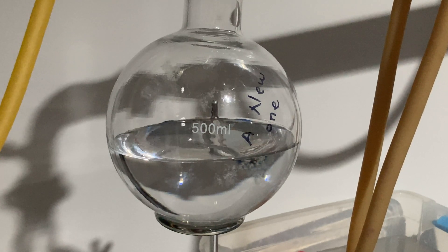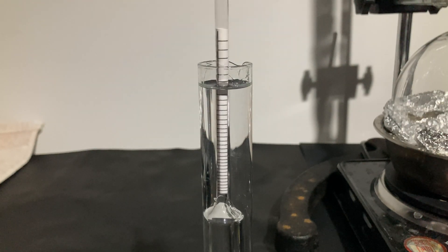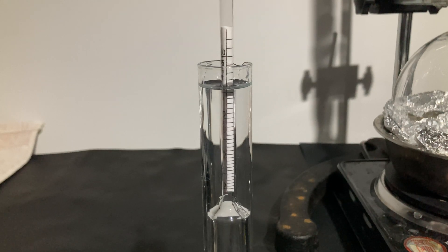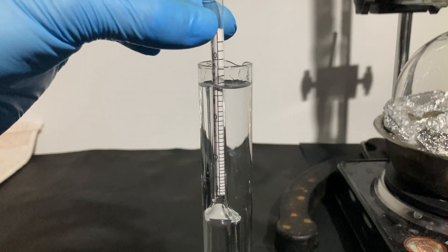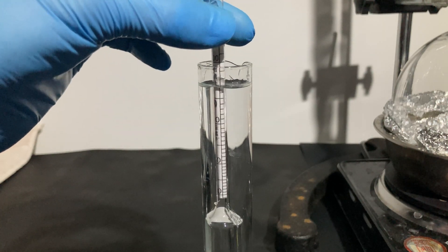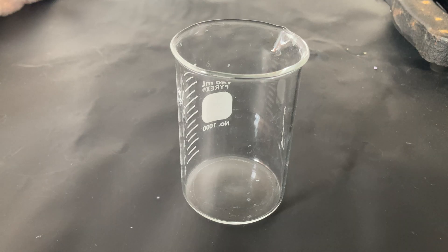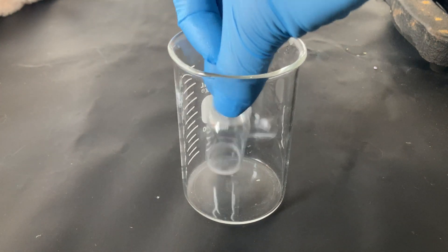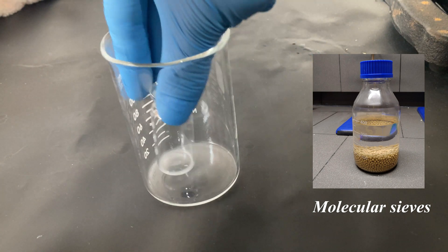An azeotrope is a mixture of two or more components that show the same concentration in both the liquid and vapor phases, meaning they cannot be separated even by fractional distillation. Water and ethanol form an azeotrope at 96% by volume of ethanol, due to the molecular interactions between them. The azeotrope actually boils at a lower temperature than pure ethanol. So how do we obtain pure ethanol? There are several ways to break the azeotrope: we could distill the mixture under vacuum, add a solvent like toluene, or more easily, use molecular sieves that selectively trap water molecules, drying the ethanol.